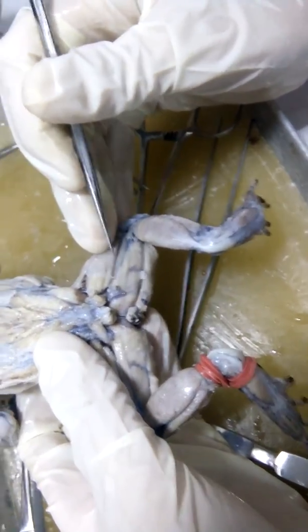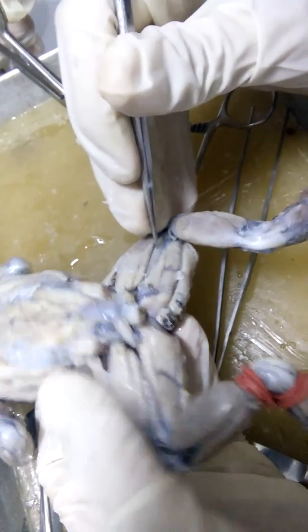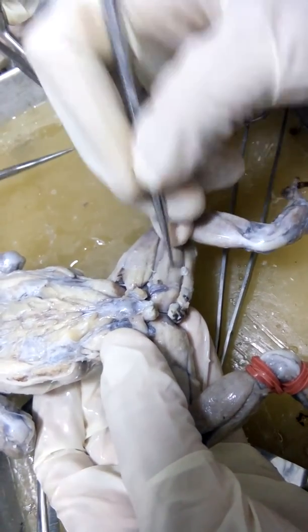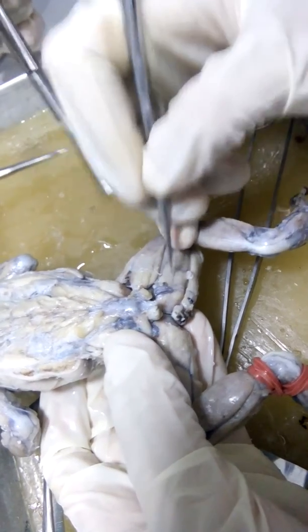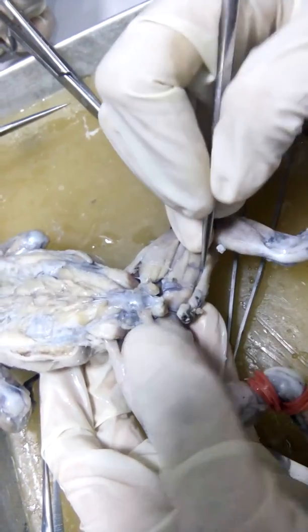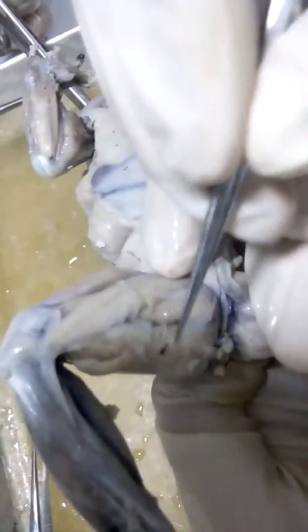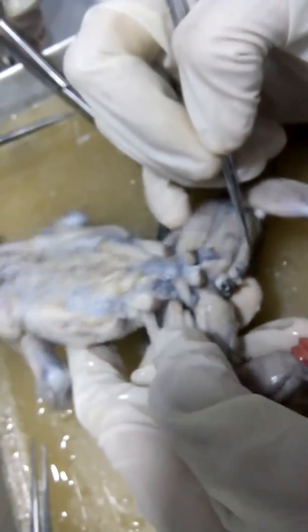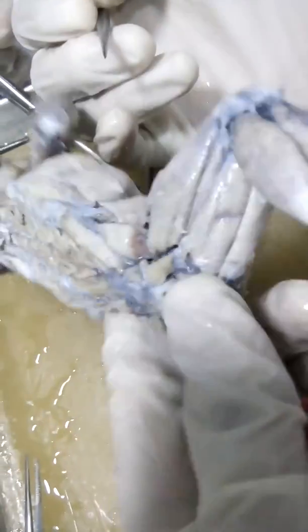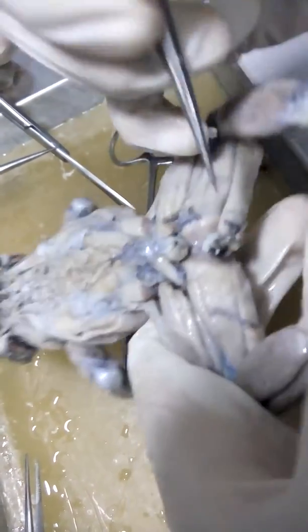Okay, then below your triceps femoris, here we can see a slender, no, this would be your biceps femoris. And then this here would be your semimembranosus. Posterior to your semimembranosus is your gracilis major. So if makita nimo siya sa imong dorsal side, mas visible imong gracilis minor. Very thin nga muscle lang.